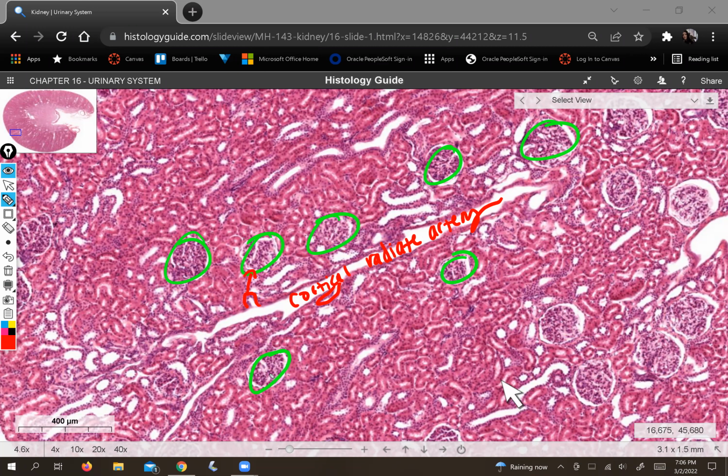So if you look really closely and you think about what you know about the gross anatomy of the kidney, and then apply it to the microscopic anatomy, there's actually a lot to see in addition to the various tubes and such. As long as you logic your way through it, like, okay, the afferent arteriole has to be connected to some artery. Which one is it? It's the cortical radiate.